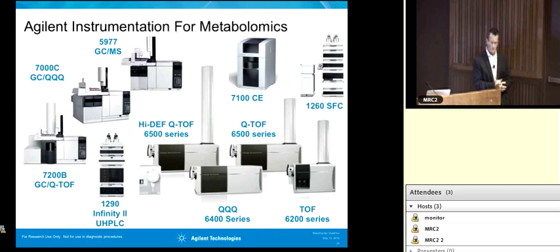So we'll integrate those EICs, and then we're going to start to narrow our tolerances and refine the data. We'll extract the MS at that point, disqualify ions that don't meet the criteria, and create a new EIC. Then we start doing some scoring, and that's based off the number of qualified isotopolog ions, their relative abundance, and how close they are to the target retention time. At this point, we've arrived at the raw isotopolog abundance. But as you've already heard, it's quite important to do a natural isotope abundance correction. That's where we use the tracer that we specified and its parent purity to calculate that. And this is all done in situ while it's processing.